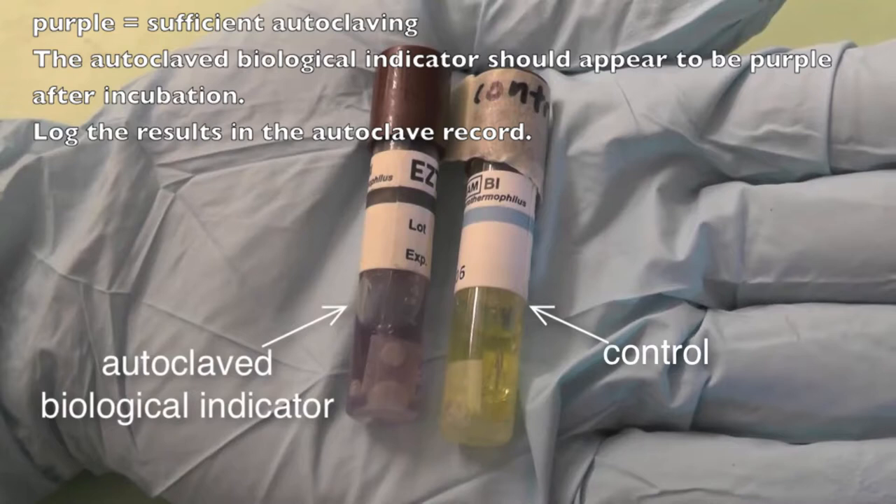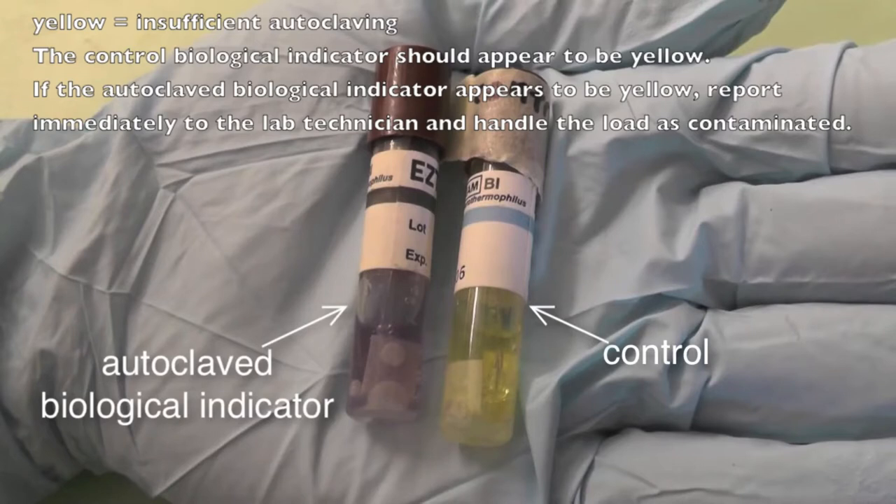In this case, log the results in the autoclave record and send it to Risk Management Services. If the color turns yellow, then this indicates that the autoclave did not function effectively to sterilize the load. In this case, report immediately to the lab technician and handle the loads as contaminated.